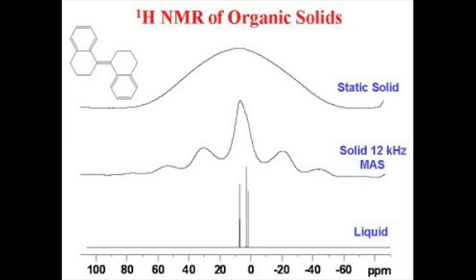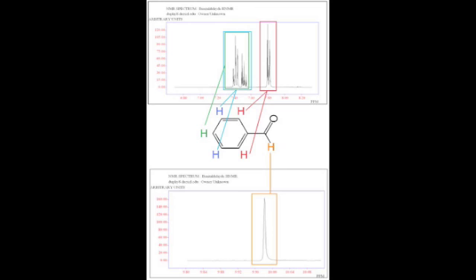The other thing I want to say is sort of a caveat. If you're looking for a physical description of why NMR is the way it is, this isn't the video. This video is more of a tutorial about how to interpret spectra of pretty simple organic compounds. So that's what we're focusing on here today.